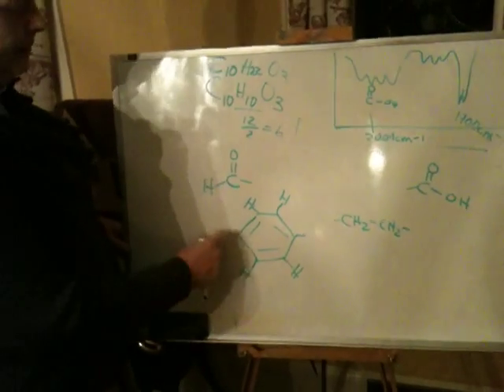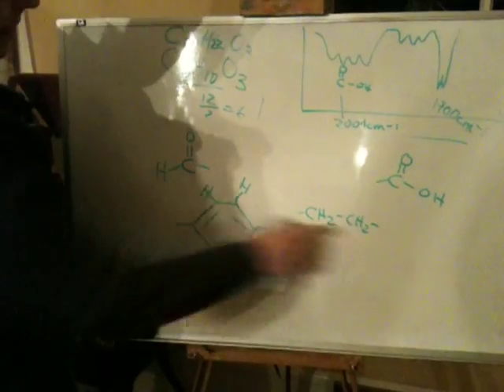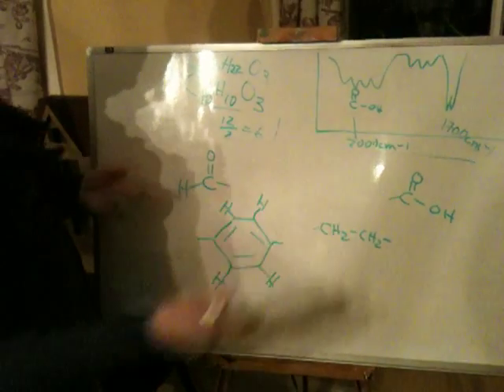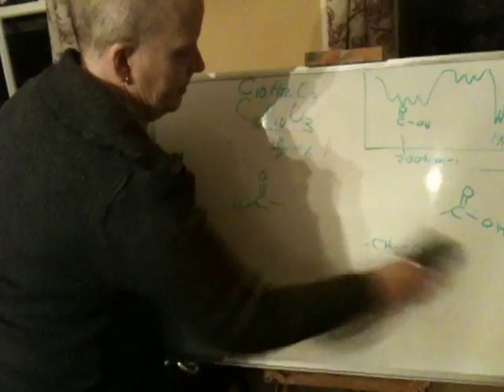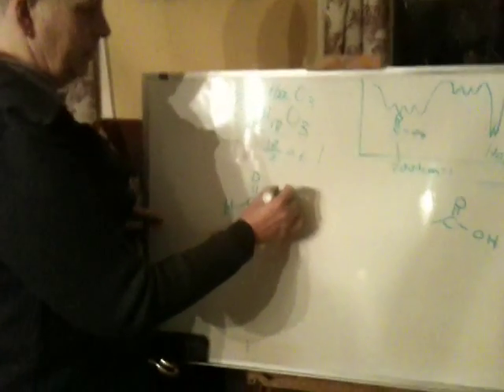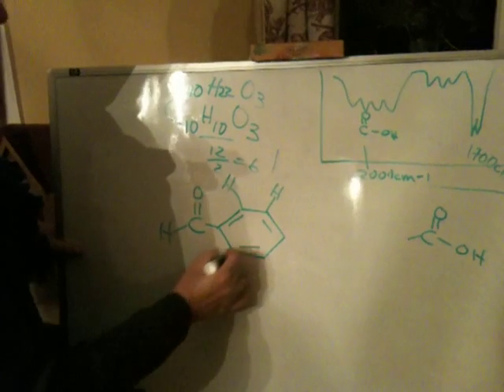It's saying aldehyde, disubstituted aromatic ring, and this is called 1,4 disubstitution. A little piece like this and a piece like this. These clearly go in the middle and these clearly go on the ends, all right? You can only put it together two ways. So let's look at the two ways you can put it together. This is one way to put it together.